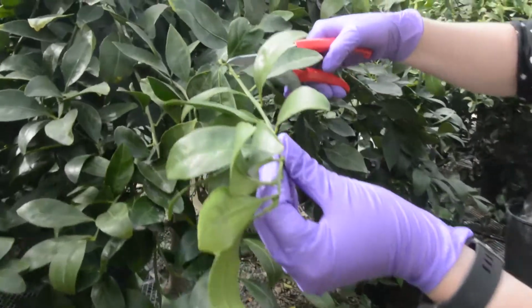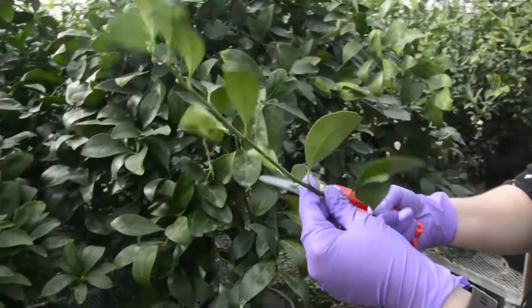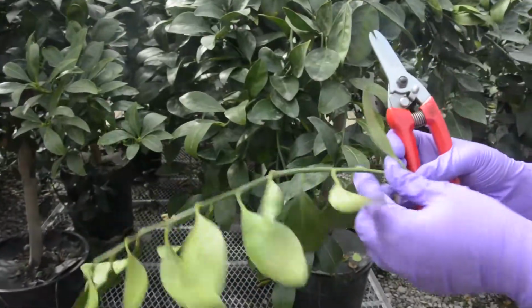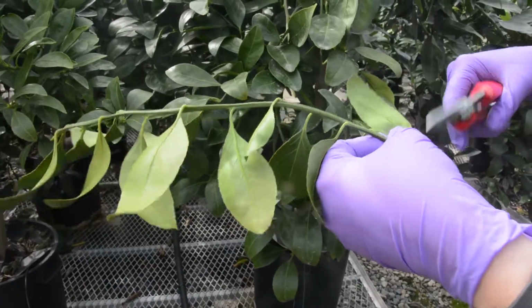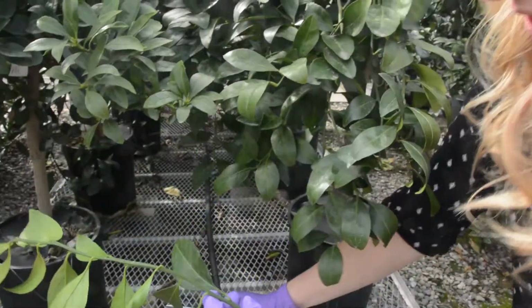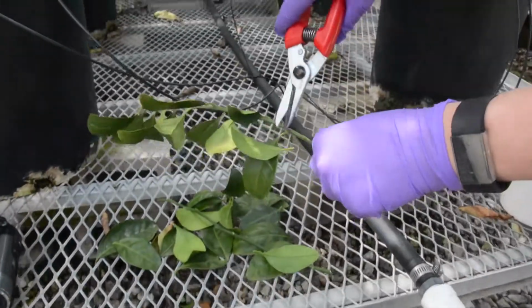So what I'm going to do is just cut off this little branch right here, and I am going to now cut the leaves off. This is what I do, just cut off right at the petiole. Just going to cut down here, like so.